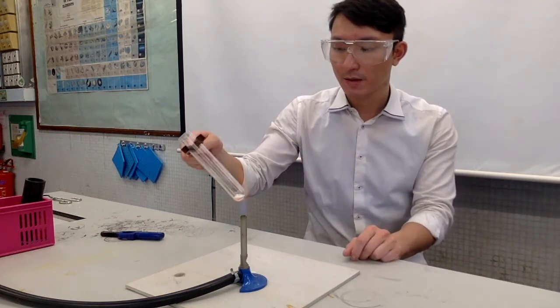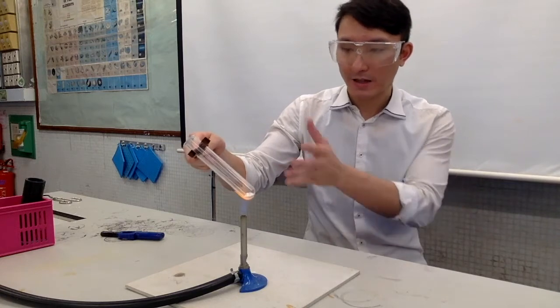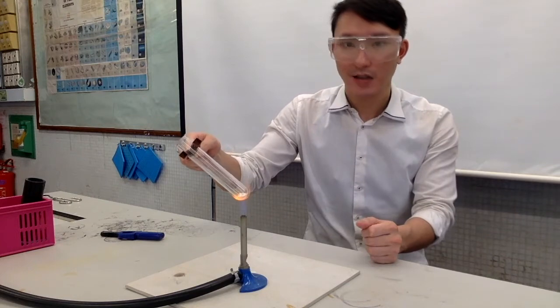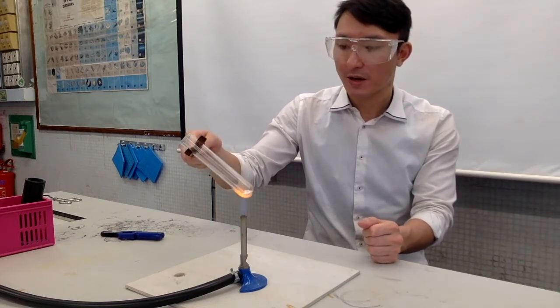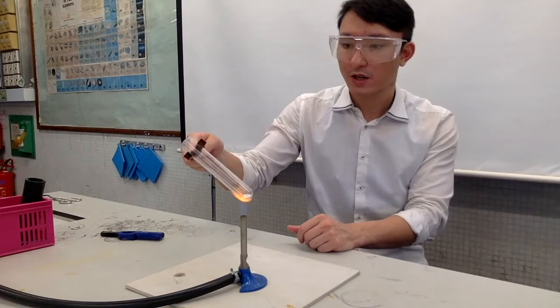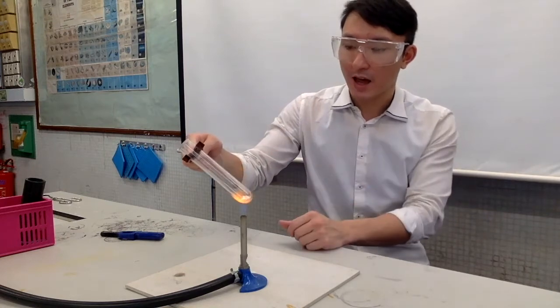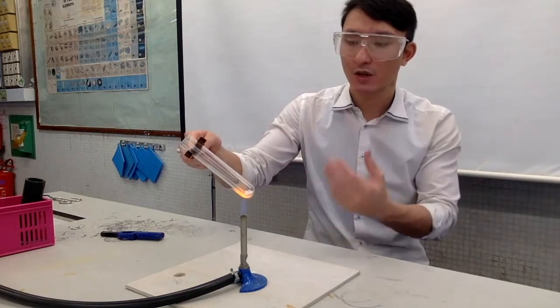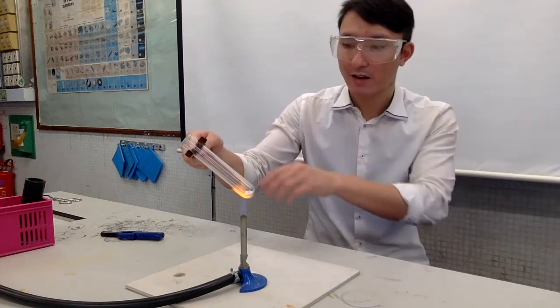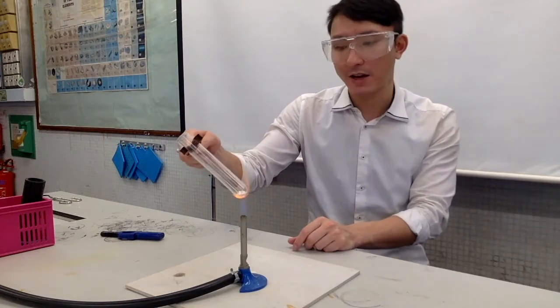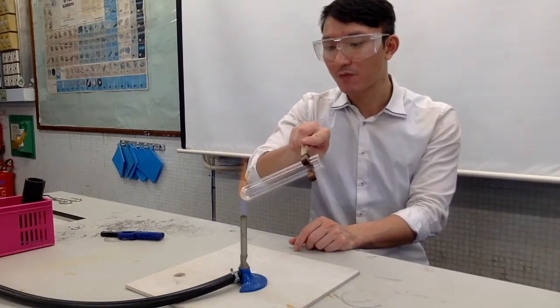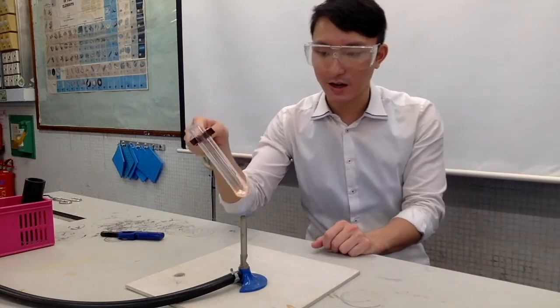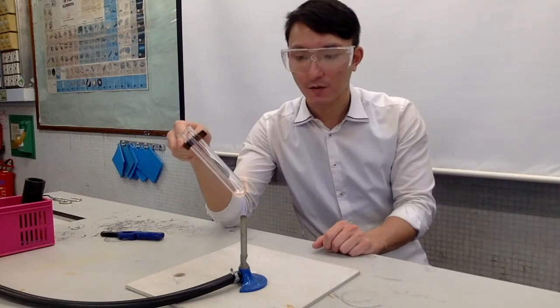I also have it tilted. Tilting is not strictly necessary here — we usually tilt the test tube when heating a solution so that if it boils, it won't shoot out toward us. But this is just the usual drill. Let's be patient and heat it for 15 minutes.